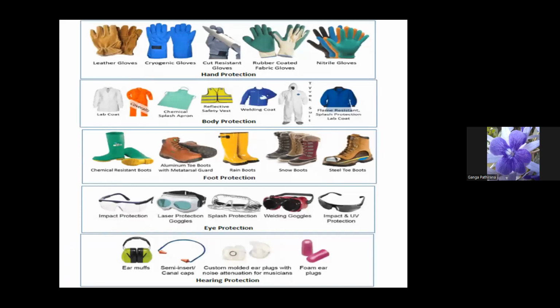There are so many types of personal protective equipment in the market, and the selection depends on the task allocated.